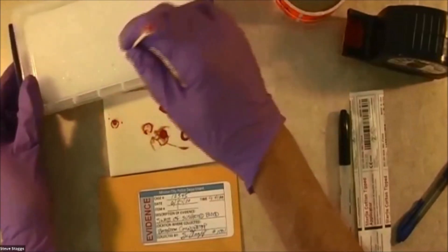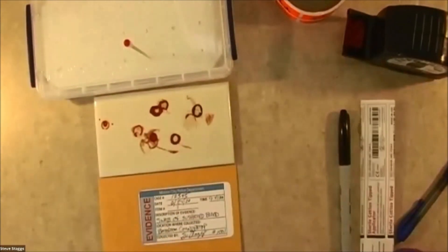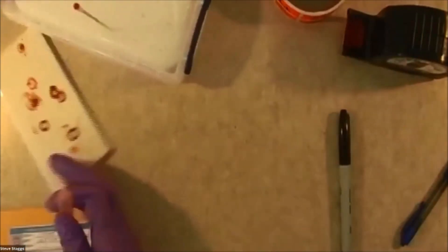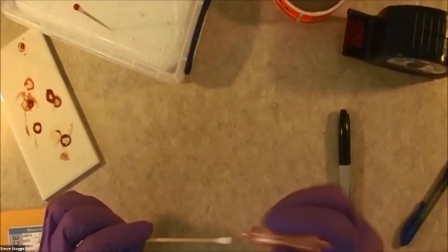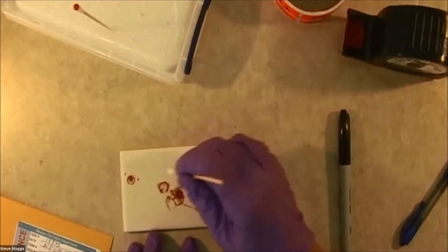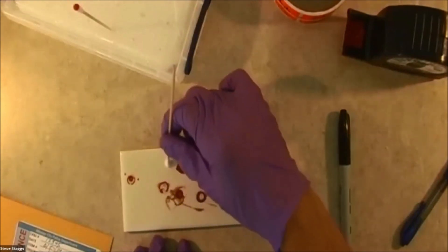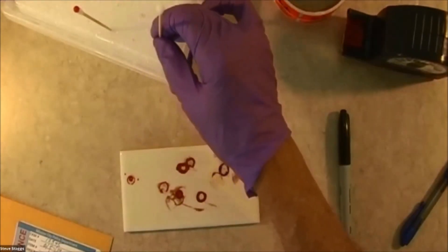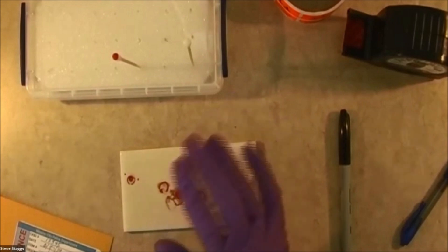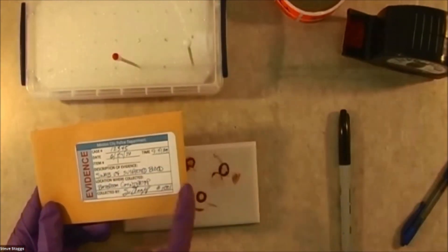Now we need to let this dry. We let that air dry. Now I need to do one more thing here — I need to take a control sample. So I'm going to open a second swab. Again, I'm going to put two drops of distilled water on it. For my control sample, I'm going to sample away from, but on the same surface, away from the evidence. It's the tip of the swab you want to get. So now I have a control sample, and you put that also into your drying rack. You will end up packaging both items — this would be item number one, and that would be item 1A. On 1A, it goes into a separate envelope, and it would say control for item one.